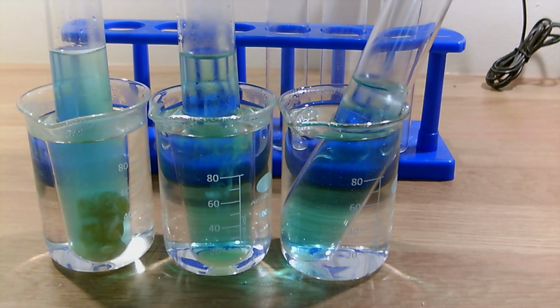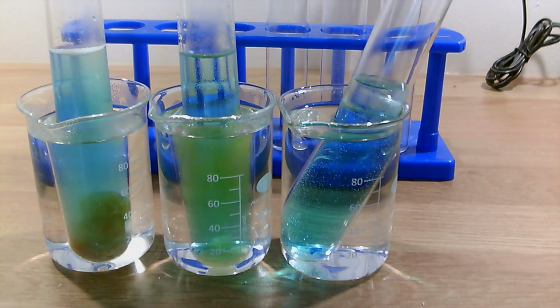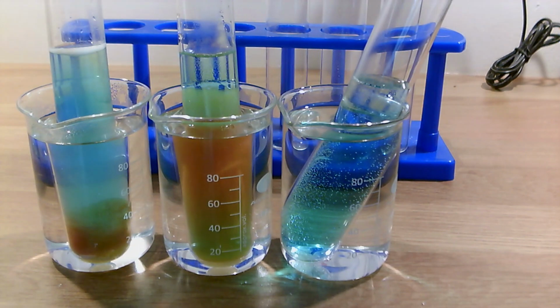The bottom of the jelly baby has changed colour to orange, and the honey has changed from the golden colour that it normally is to yellow, and then to green, and then the last colour that it changed to is a really dark orange. It looks amazing when it is changing from so many different colours. Nothing has happened to the colour of the sugar. It was a video that was sped up when the colours were changing.